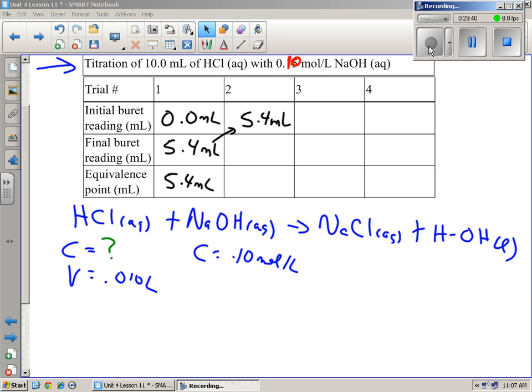All right, so we got our 10 milliliters of acid. Don't forget the indicator, 2 drops. Make sure the drops go down the middle, right into the middle here. If they go along the side, that doesn't count, because you're not going to see anything. It's going to go too far, and you're not going to get the measurements that you need. Okay, stir it up a little bit, put it underneath here.